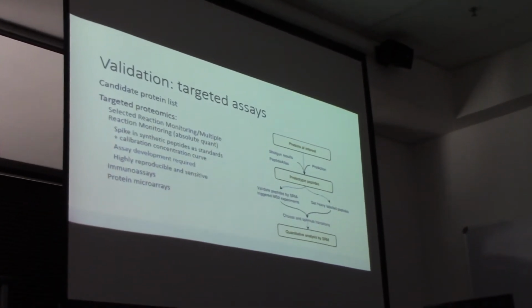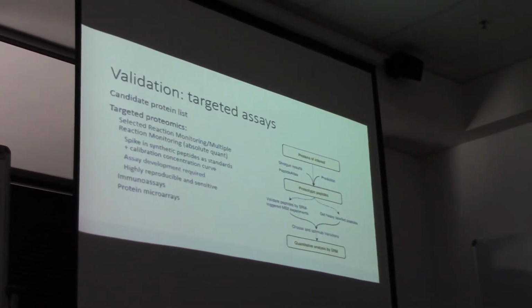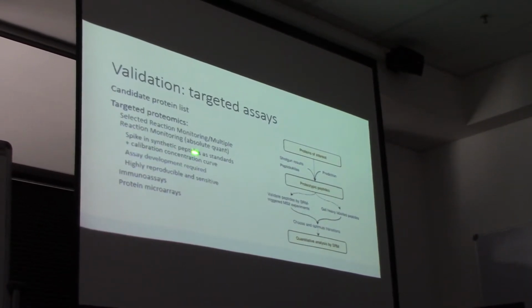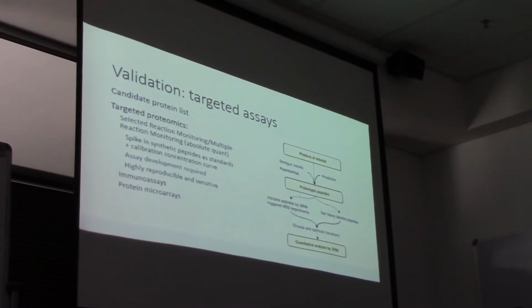That's how I validated all of my proteins, if you have antibodies, we already talked about that. Most people now are starting to move to selected reaction monitoring. It's also known as multiple reaction monitoring. So SRM, MRM, it's an absolute quant.